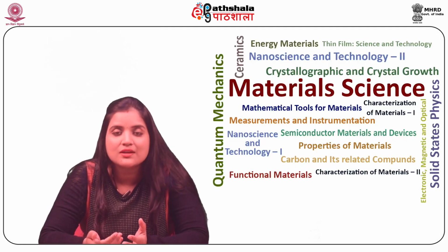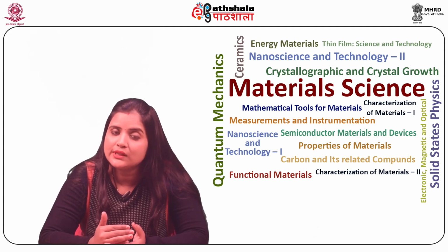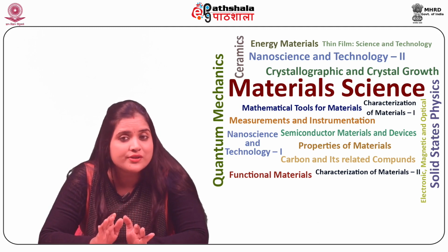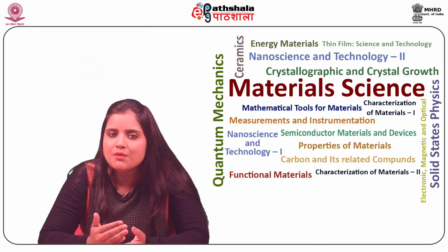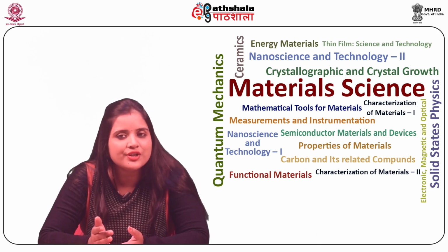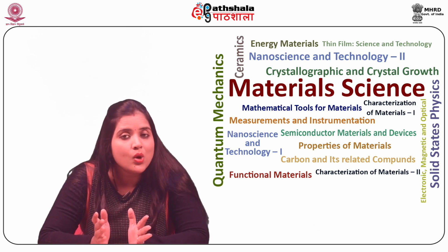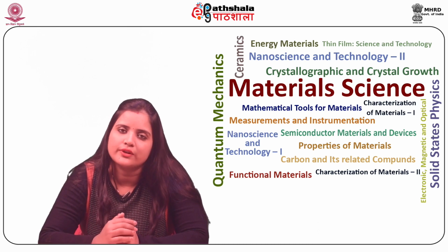Let us now discuss the advantages of SPM. Firstly, the resolution of SPM is not restricted by diffraction and therefore it can be of the order of a few picometers. Secondly, the interactions between the probe and the sample extend only across the tip atom or atoms involved in the interaction.